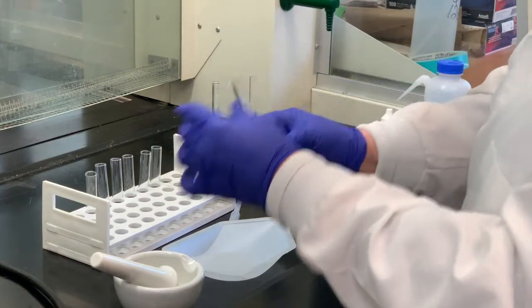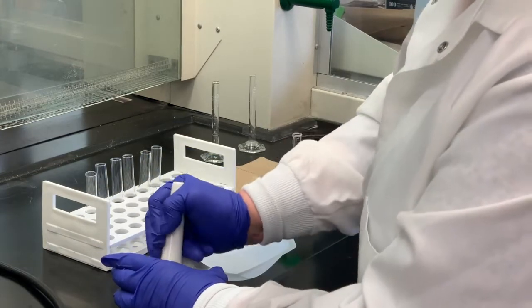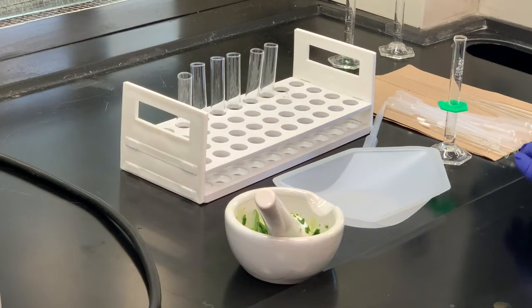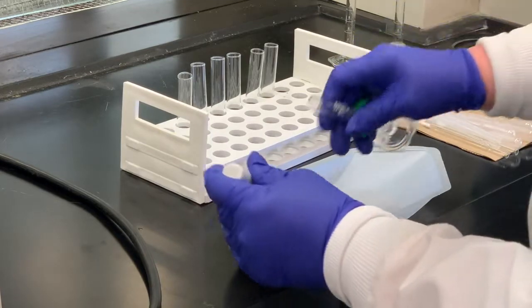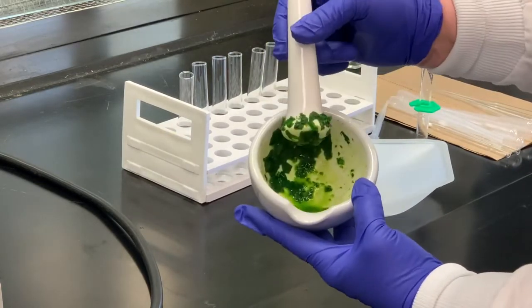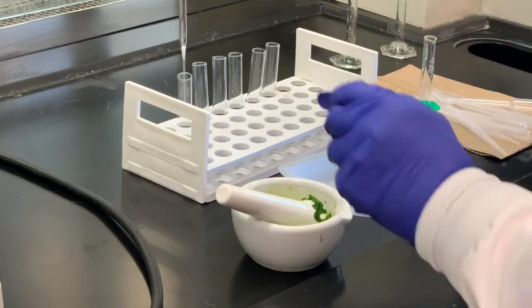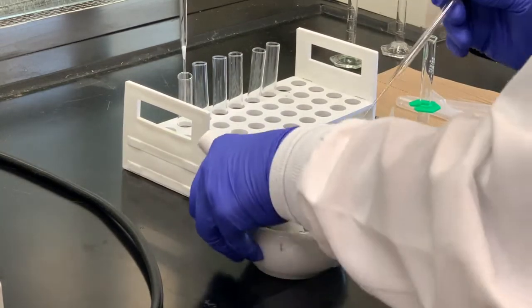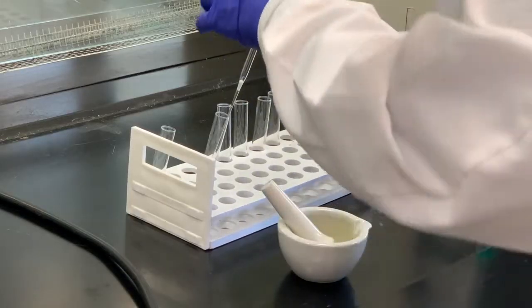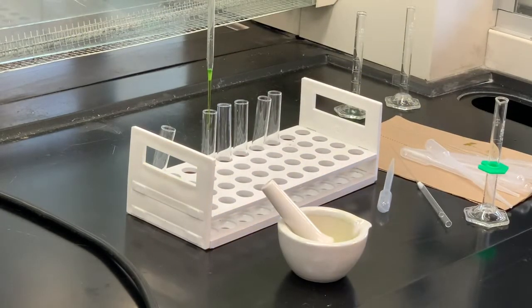We're going to use around two milliliters of acetone. I'm going to pour that into the mortar and pestle and then grind. It is possible that some of your acetone will evaporate, so I'm going to add a little bit more. What we're trying to do is get as much of the liquid away from the spinach. I'll pull the liquid up into a pipette and filter it through a cotton plug, because I don't want any of the solid material — I just want the liquid.